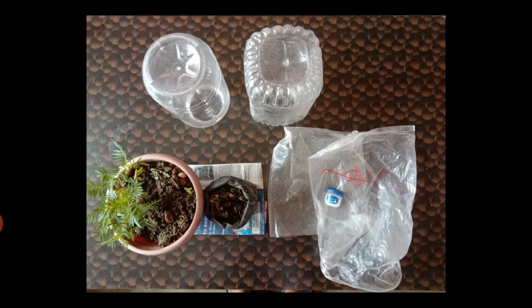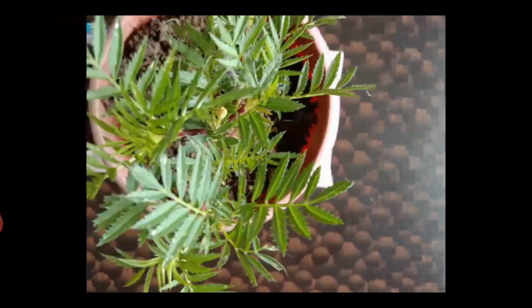In order to do this experiment, first you should remember the things that you need. The materials required: the picture I've shown you there. These are the items that we need. The first one is a small potted plant.